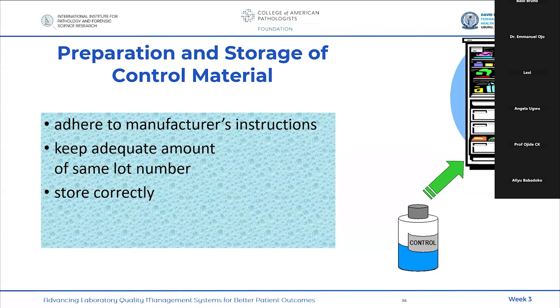So this particular scenario is to further emphasize the need to adhere strictly to manufacturer instruction, especially when we say, bring this out, keep on the bench, let it attain room temperature on its own. And what we do, again, will be that in my standard operating procedure, there will be the need for me to say, to avoid a case of ambiguity, if you bring it out from the fridge, it should attain room temperature after placing this for, let's say, about 15 minutes or thereabout.